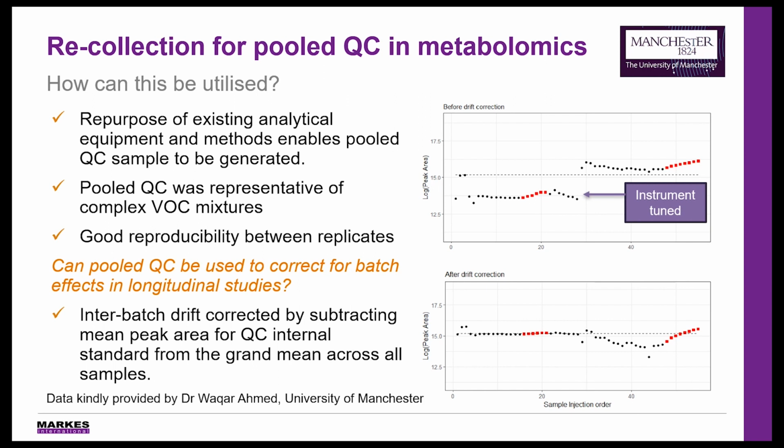Have a look at the images on this slide. The top image indicates the responses, where we can see that when the instrument was tuned between batches, there was a change in response, which you would expect, but they are quite significantly different.